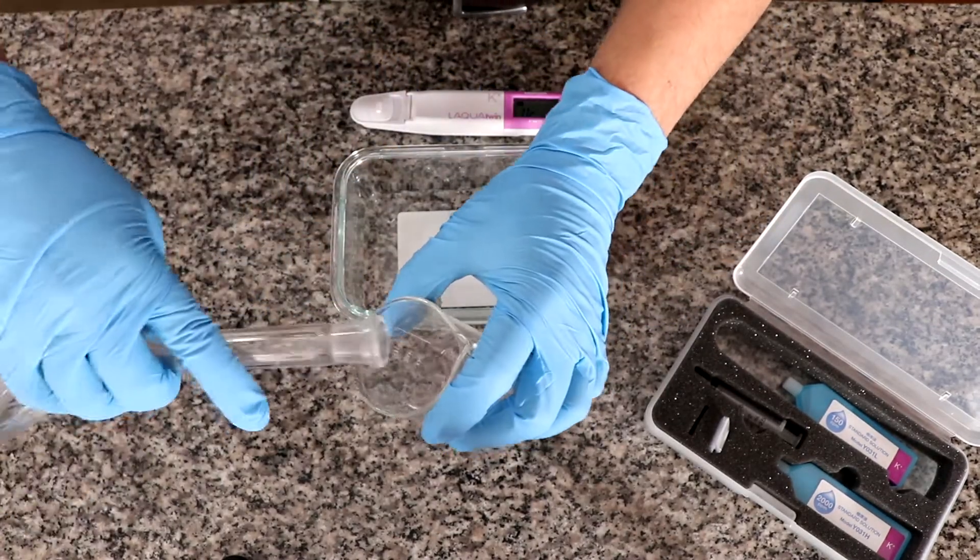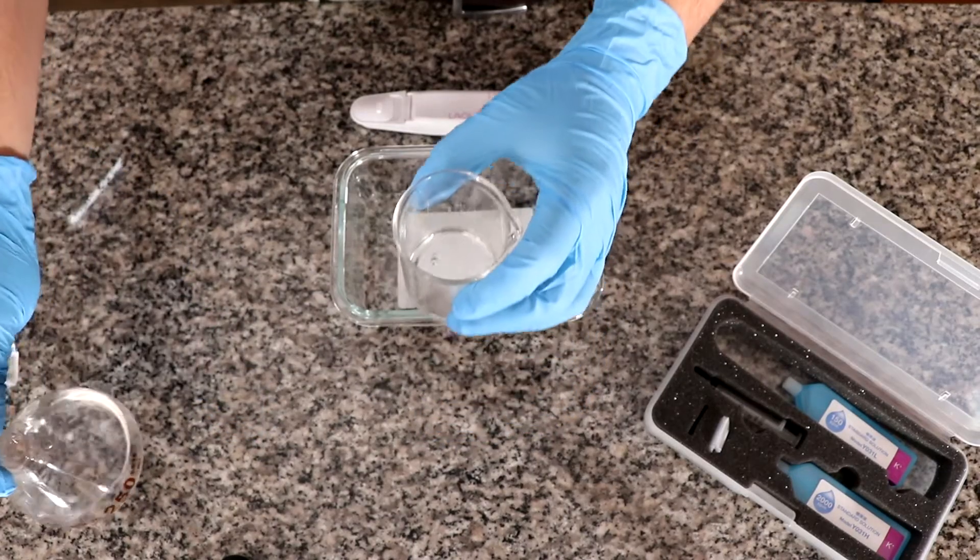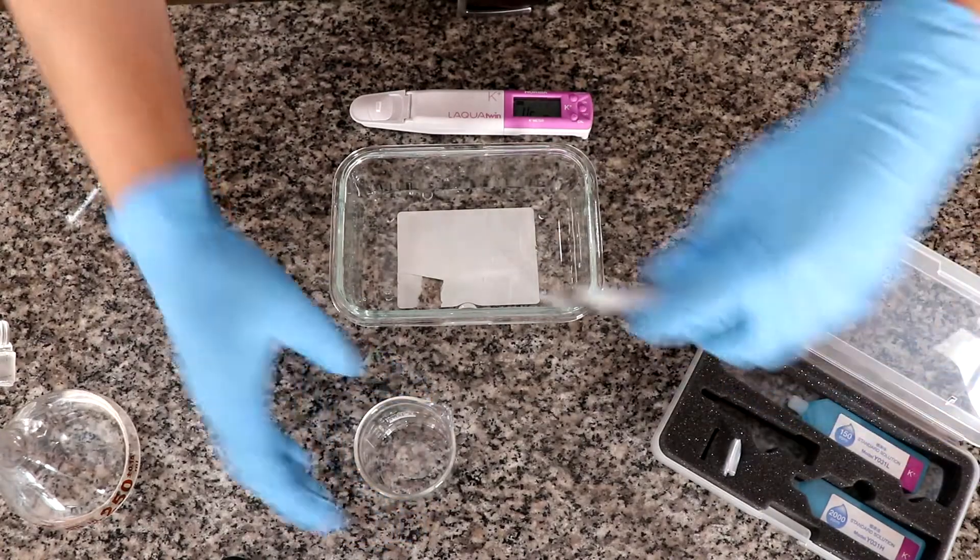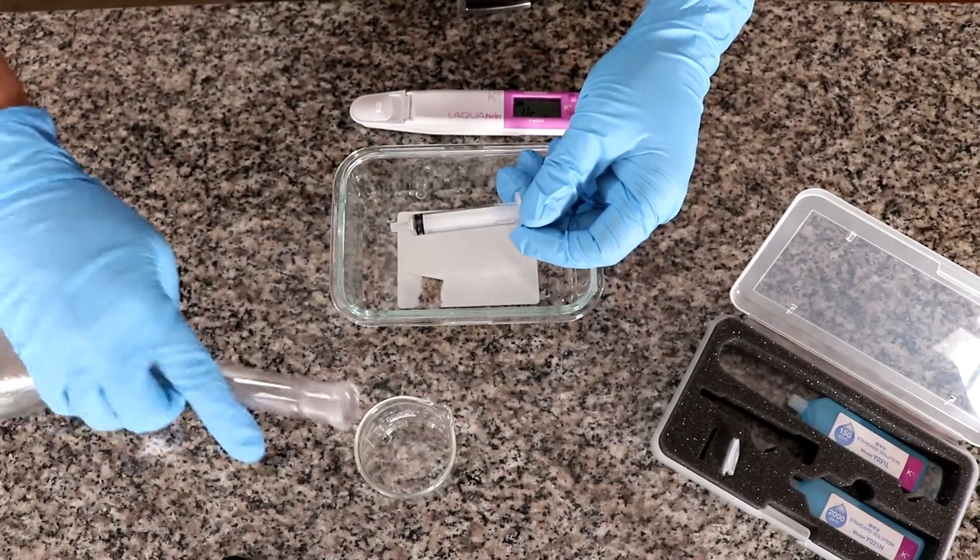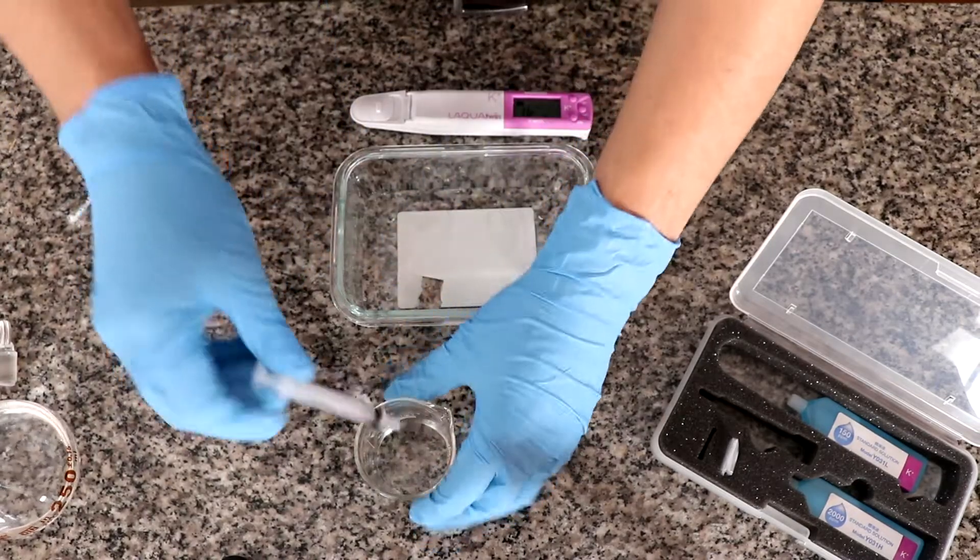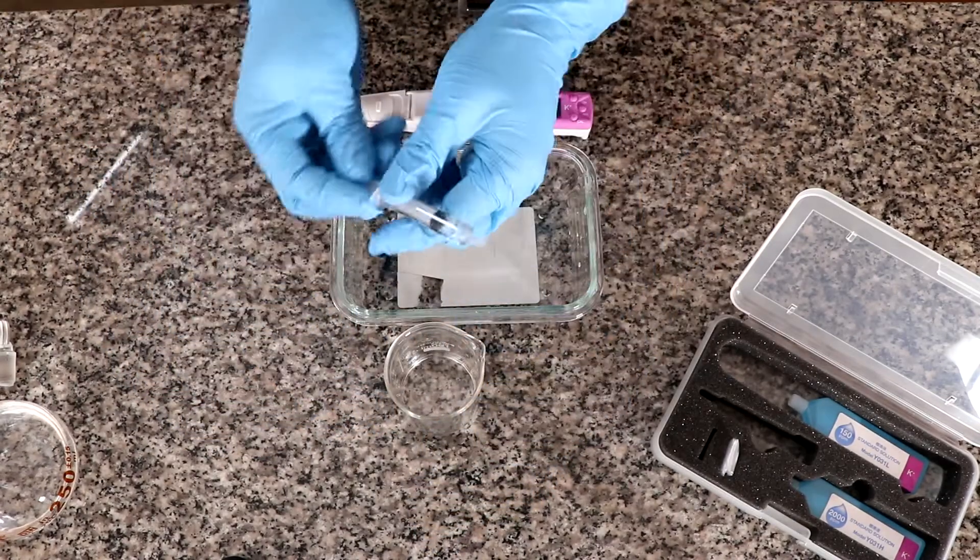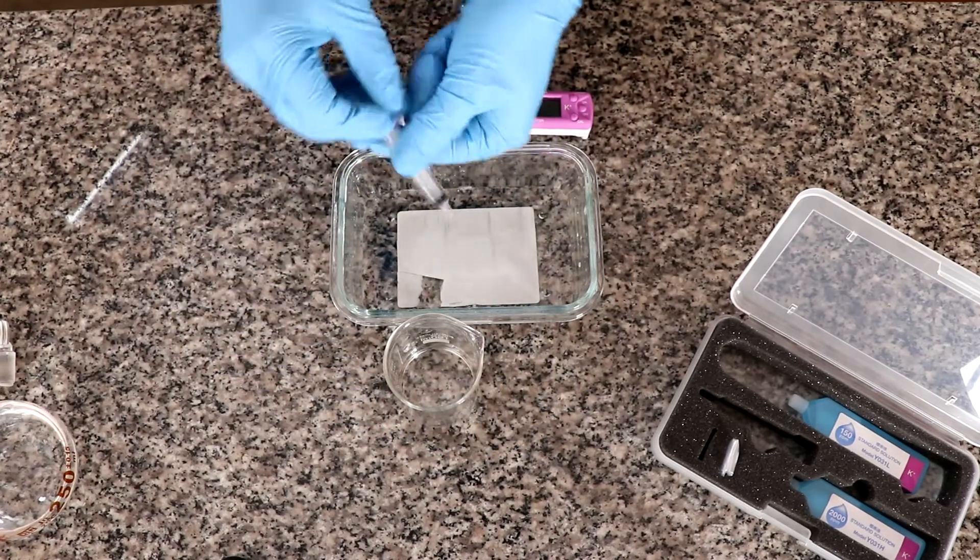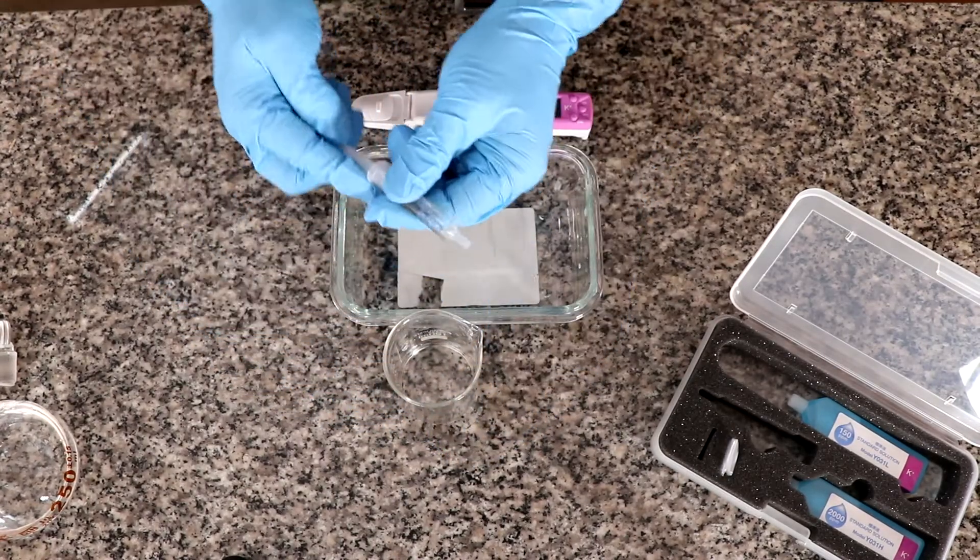So we'll see what the concentration of this fertilizer actually is in potassium. So I'm going to purge this beaker first. Now I'm going to use the syringe that comes with the electrode in order to measure. So I'm going to purge this two, three times.